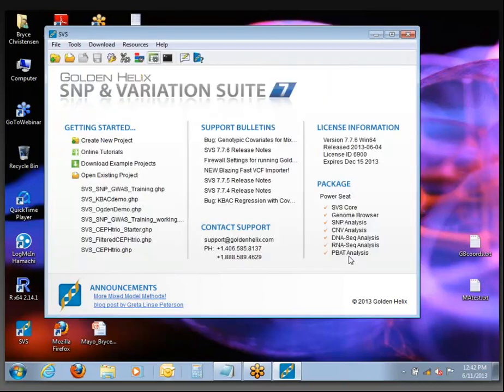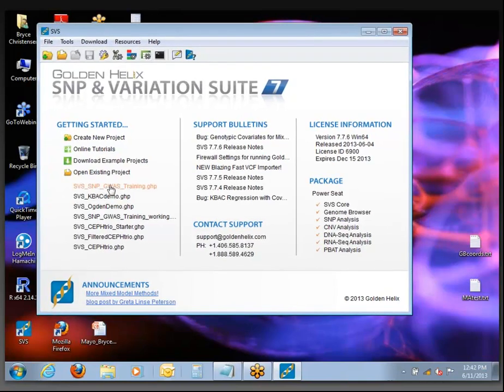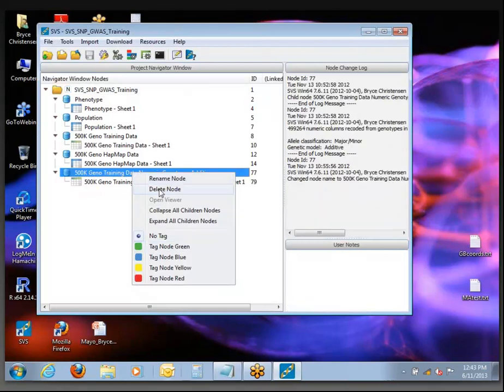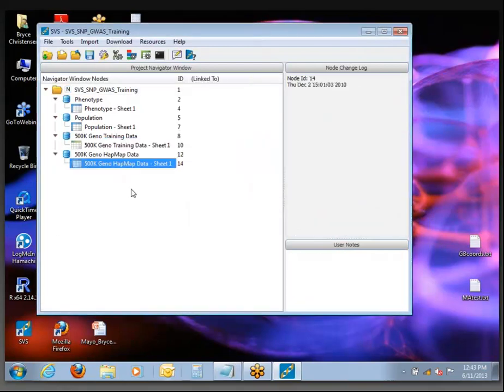Cancel out of here. Now, you should have a data set. Do you see an item in this list that has a name similar to this one, SVS SNP-GWAS training? Go ahead and click that. When you click it, you should see a project navigator screen very similar to what I have here, although I don't think you have this last node, so I'm just going to delete that so we're all looking at the same thing.